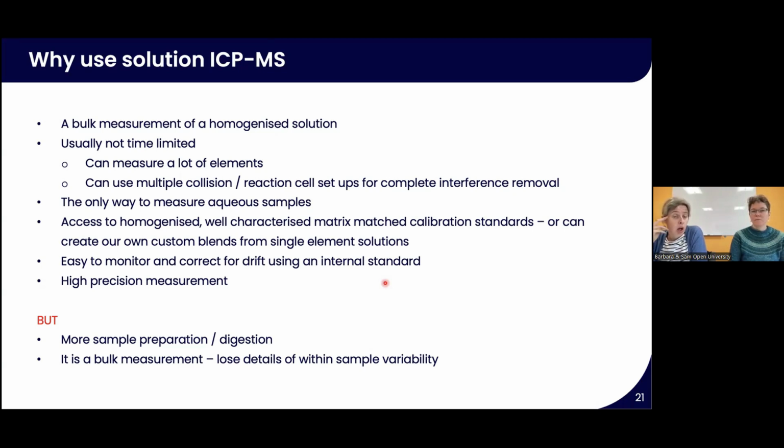We've got access to a well-characterized set of matrix-matched calibration standards for the silicate work that we do, some basaltic tholeiitic reference materials. But we can also create our own custom blends by mixing single element stock solutions to create blends that replicate the samples that we're looking at.